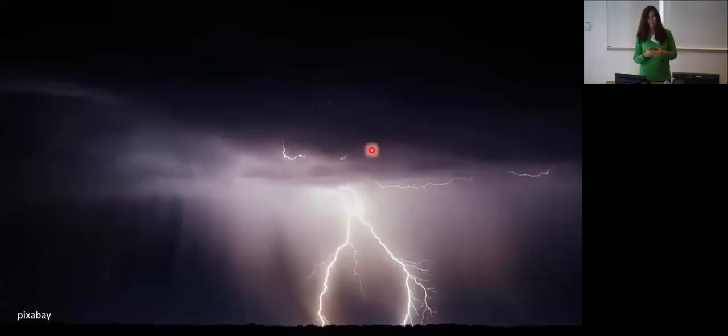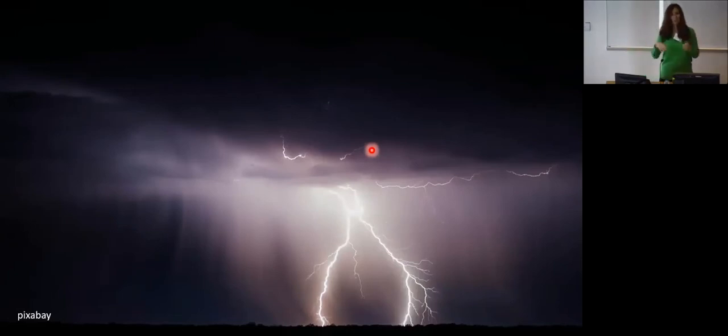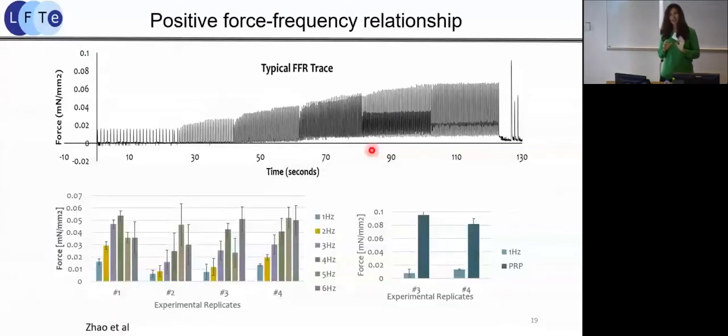We want to make the tissue very, very strong, not just a regular tissue, but really mature it beyond what we achieved before. So again, we apply this electrical stimulation, but we now go up to 4 weeks and we ramp up to 6 hertz over a period of 3 weeks. So 1 week for gel compaction and 3 weeks for maturation with electrical stimulation. And then after that, we get some really functional hallmarks of a quite mature cardiac muscle.